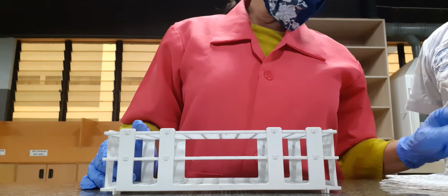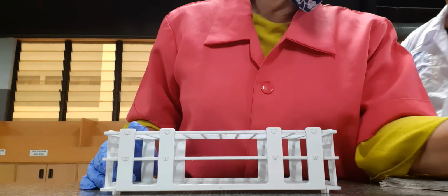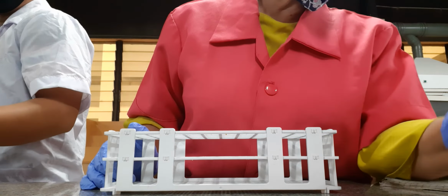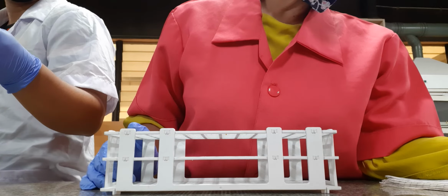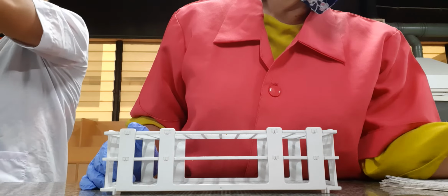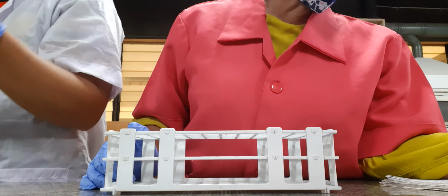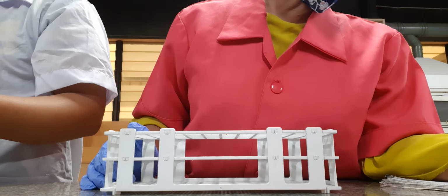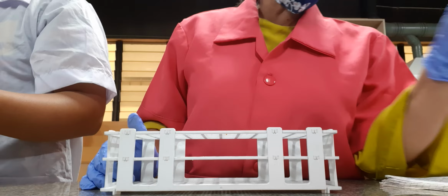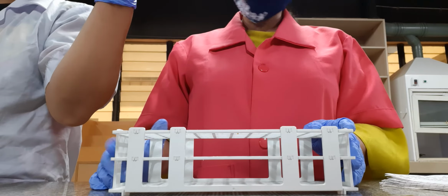We will be using the Tollens test, or silver mirror test. Tollens test or silver mirror test. It is also an oxidation test.